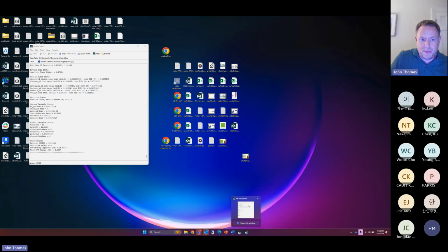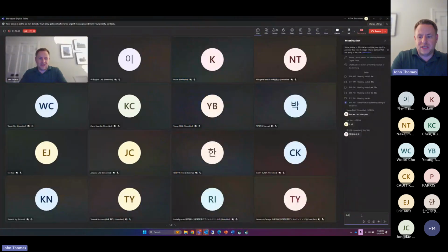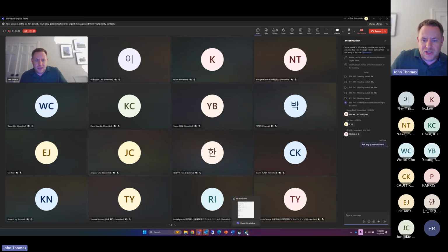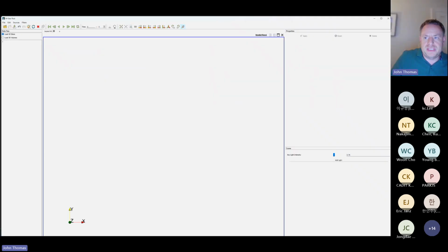Well, this is what people might be thinking. I'll just reemphasize this. Please chat here and ask any questions here. I'll invite people to do that under the chat option. And just checking in on this, this guy's running just as I promised, right? He's moving through space and time.